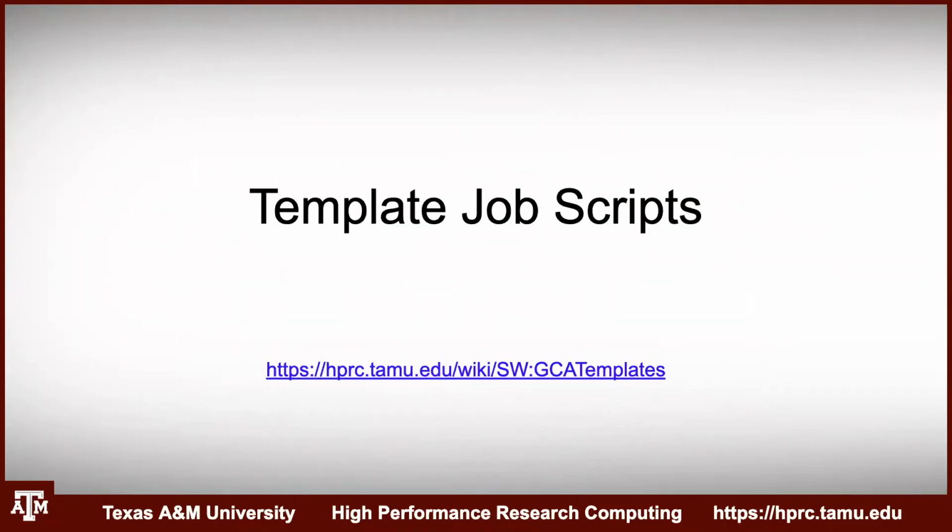All right, so now we're going to go over template job scripts. Michael has generated a number of scripts for different tools to make it easier. For example, say I want to run a software package that I've never run before, and I'm still learning what I need to do.